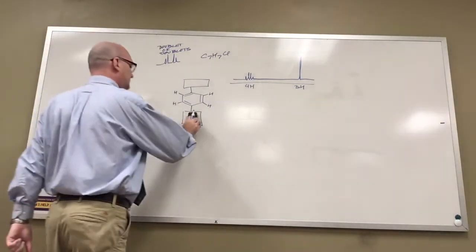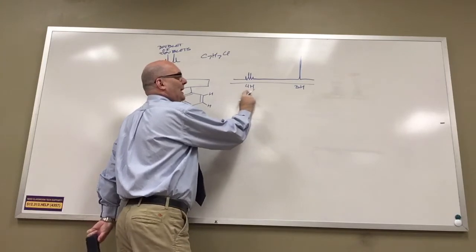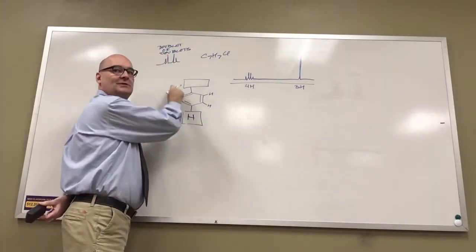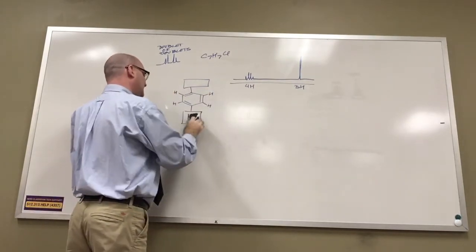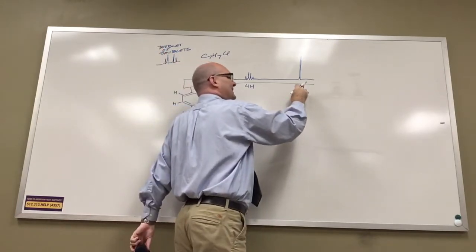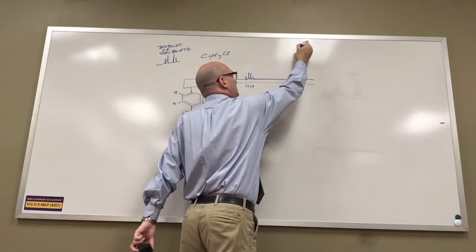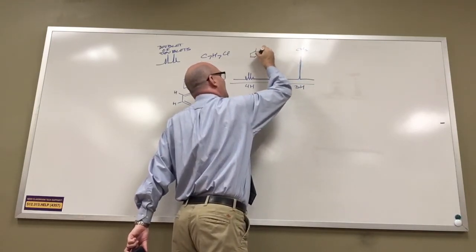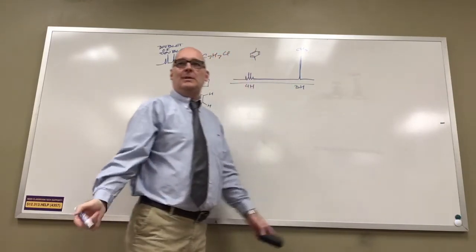So it's a methyl and chlorine that we use for substitution. This tells me there are 4 hydrogens on the ring. If I put a hydrogen in this box, there are now 5 hydrogens on this ring. So it's not a hydrogen. The integration on this signal is 3 hydrogens. Surely that's a methyl. A 3 hydrogen signal is a dead giveaway that that's a methyl.